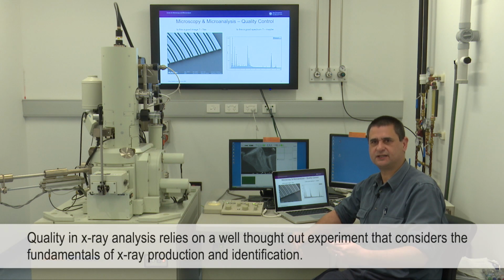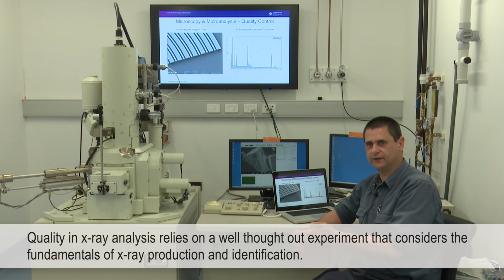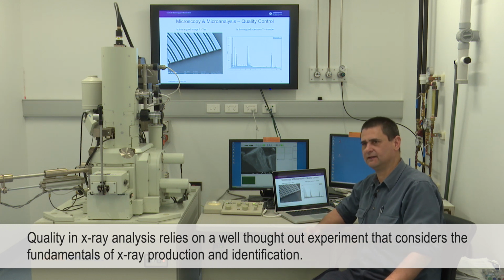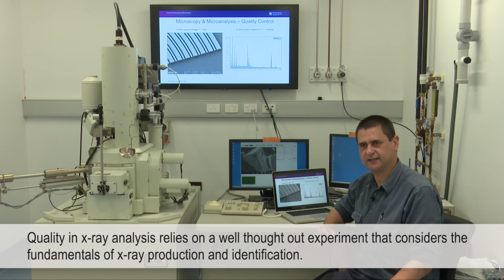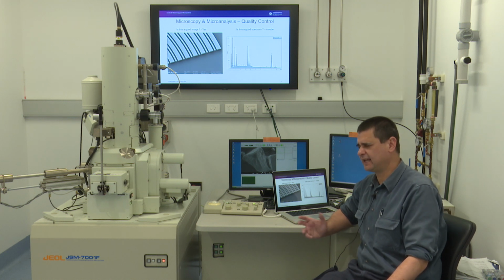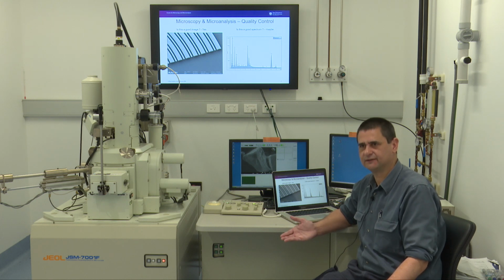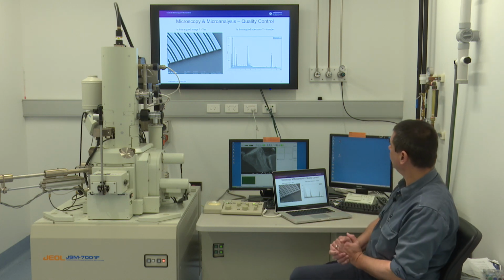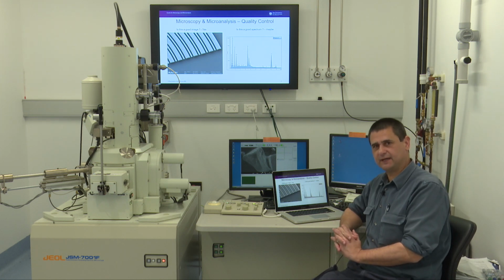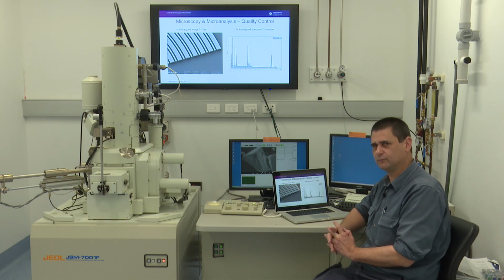Quality in analysis usually comes from the beginning, moving it forward so that you trust the result, as opposed to looking at the result at the end and saying, yes, that's a publication quality image I can use. I myself keep a lot of images that in the end I decide not to use. They're not good enough. Yet I see people in microanalysis often keeping spectra which I wouldn't trust, yet they don't know not to trust it. So it's all about quality control. And for those who care, yes, there is an error in that spectrum, and it's very hard to pick, and most people wouldn't have picked it.